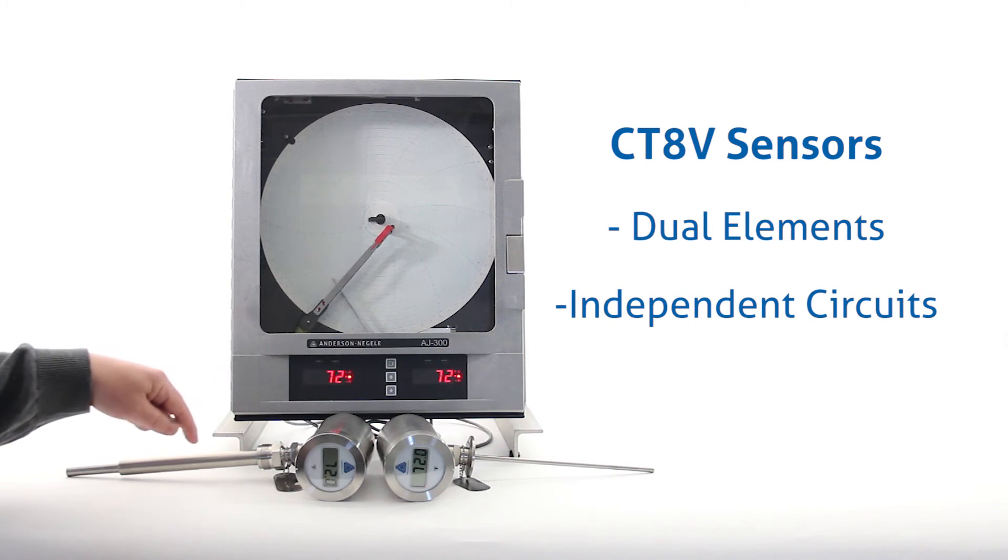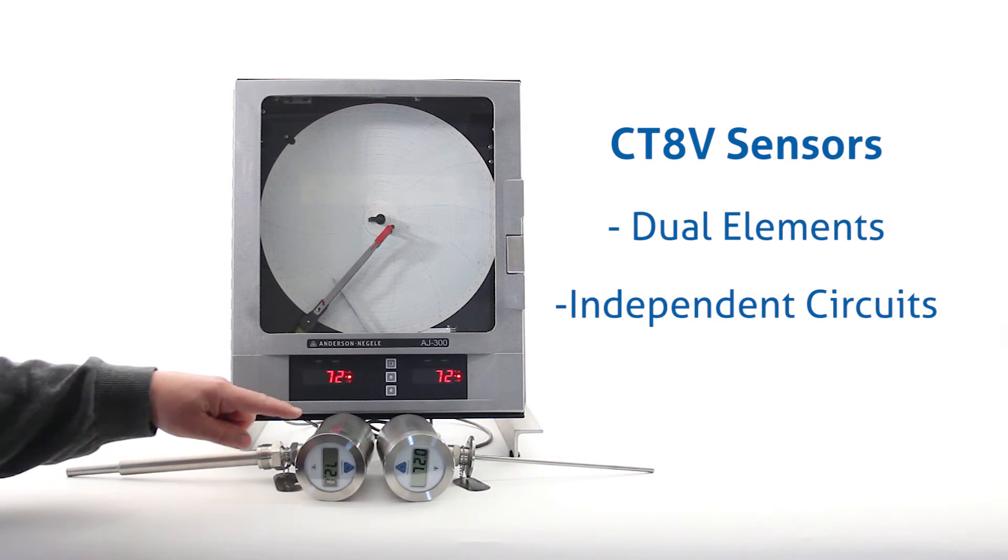The sensors are made with special dual elements inside the stem which are totally independent circuits. This allows the displays on the sensor heads to be used as a comparison to the readings on the recorder.